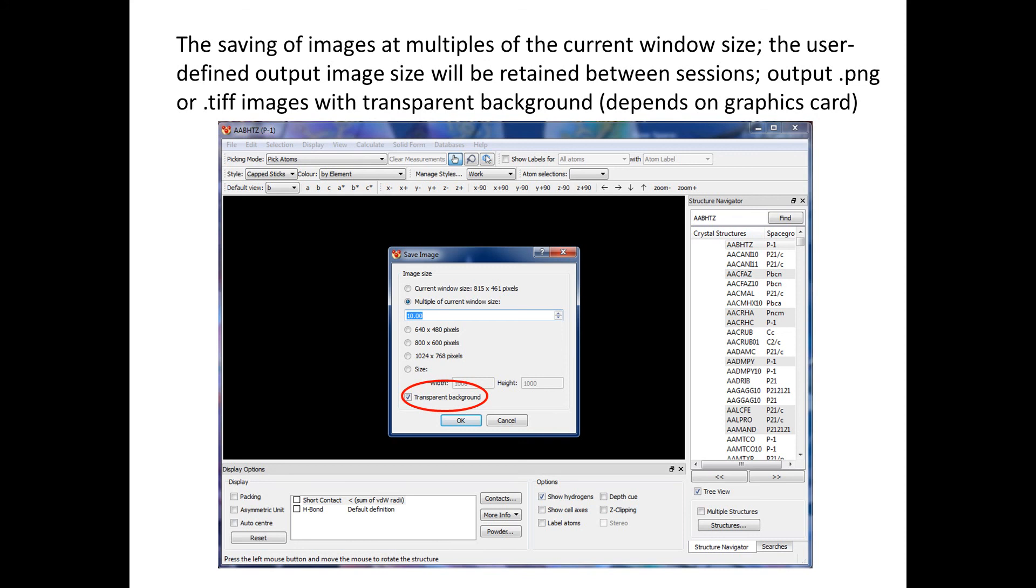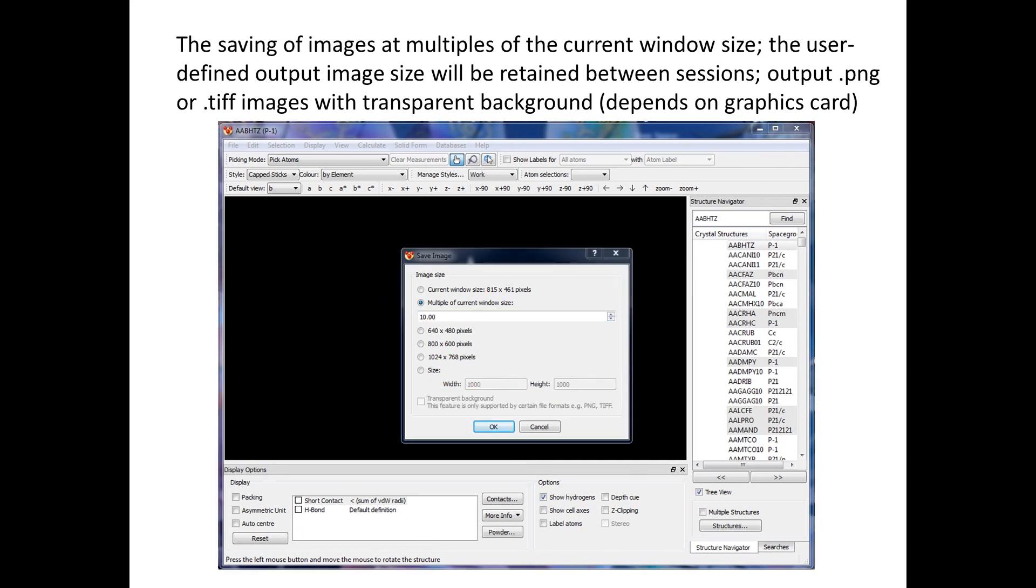Now this will depend on two things: one is the graphics card and the other is the image output format that is chosen. Only PNG and TIF images can at the moment be saved with transparent background. If you choose any other image output format or if your graphics card does not support transparent background, there will be a message telling you that the feature is not supported.